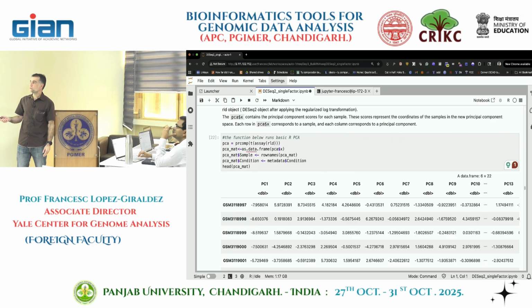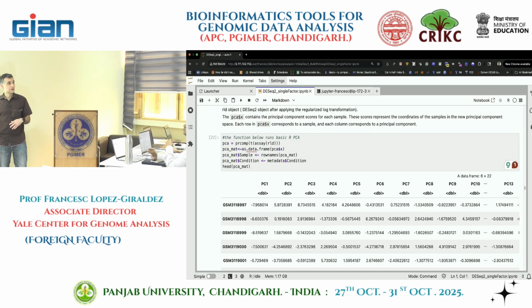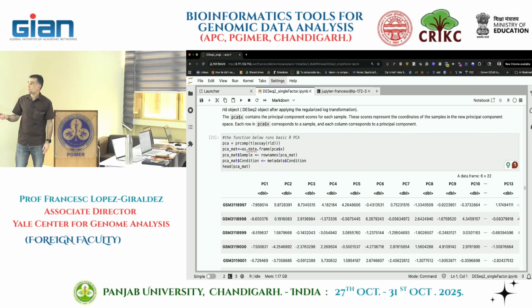So basically what I'm doing here is I obtain all our PCs, all our samples, and the coordinates. So now I can take this and use any plotting system and replot the PCA. Why I'm doing all this transformation is because of how the data is returned as an object. But don't worry about it. I'm just showing you that you can plot the PCA using the normal function.